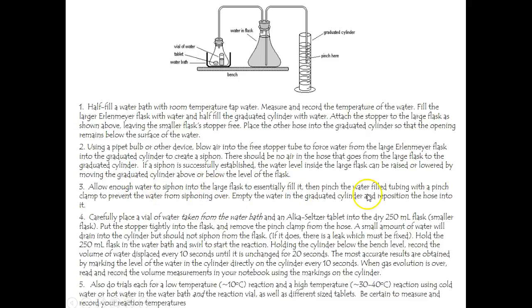Empty the water in the graduated cylinder and reposition the hose into it. Carefully place a vial of water taken from the water bath, and an Alka-Seltzer tablet into the dry 250 milliliter flask. So there's the water that should be the same temperature as the water bath, as long as you operate fairly quickly, I would think. There's your Alka-Seltzer tablet.